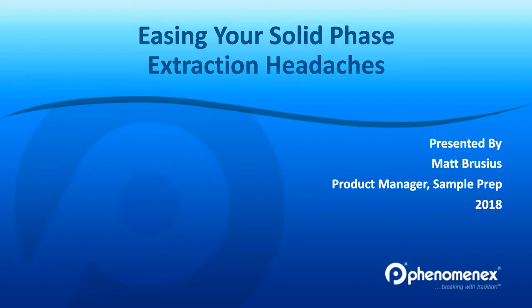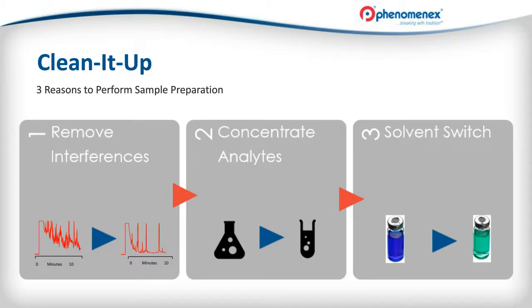Today, the topic is easing your solid phase extraction headaches. I have a handful of slides to get through, so I'm going to go quickly, without speaking quickly, of course. So the first thing, kind of historical background on why we would perform sample prep.